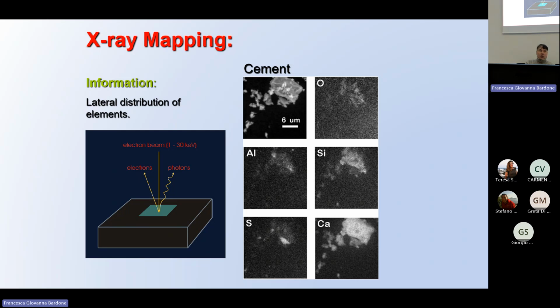If you want just a rough estimate, you can use systems which are called standardless methods. They compare the intensity with intensity stored inside the system, in the computer. It can give you roughly an estimation of how much there is, but the error is about 10%. It depends on what you need.